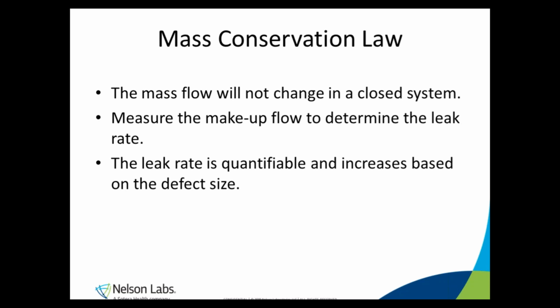So for an example, if my product is a 20 ml fill vial, the leak rate I determine equates to a 2 micron defect will be relatively consistent from day to day. But if I switch to a 10 ml vial, now that's a smaller vial, so now we have more free space, and I use the same test chamber, then I would expect my leak rate for the 2 micron defect to be slightly different.